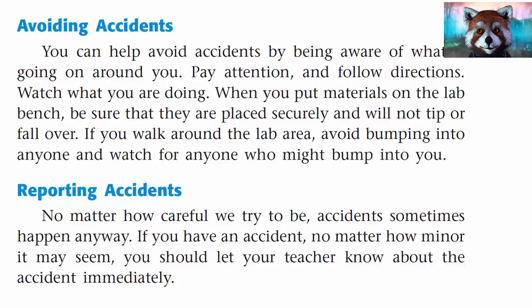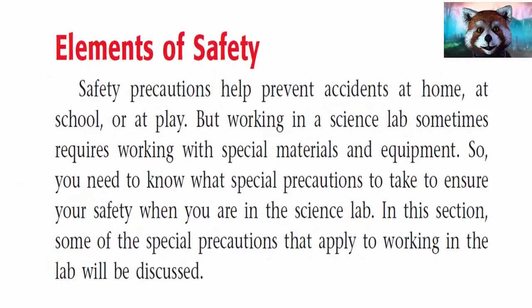Reporting accidents. No matter how careful we try to be, accidents sometimes happen anyway. If you have an accident, no matter how minor it may seem, you should let your teacher know about the accident immediately.